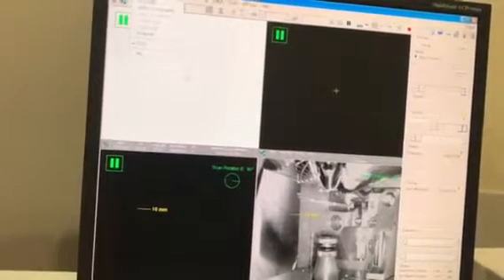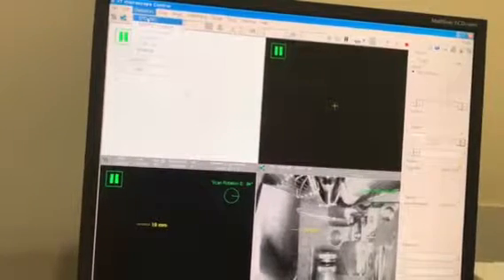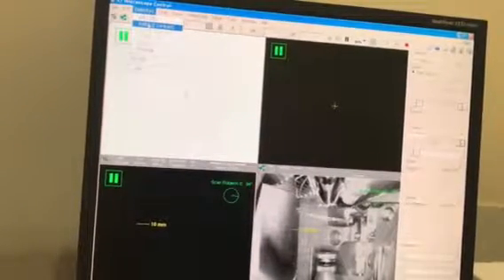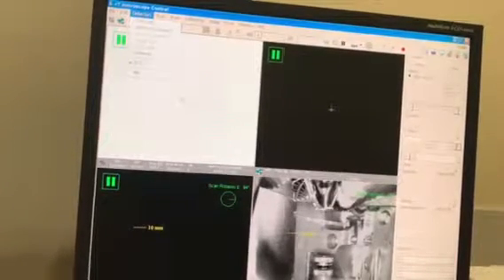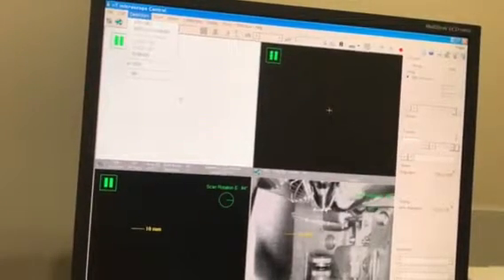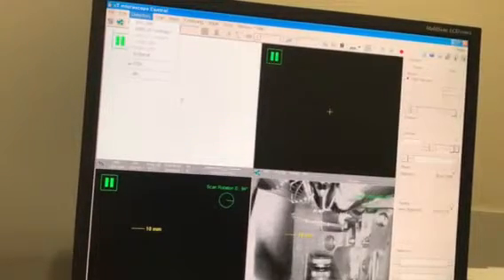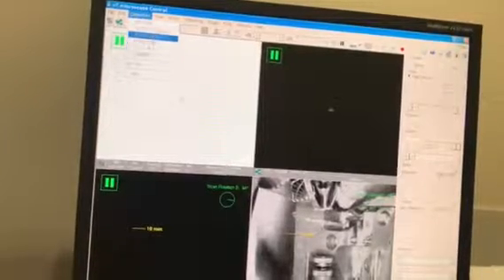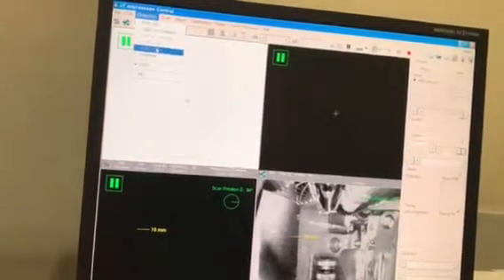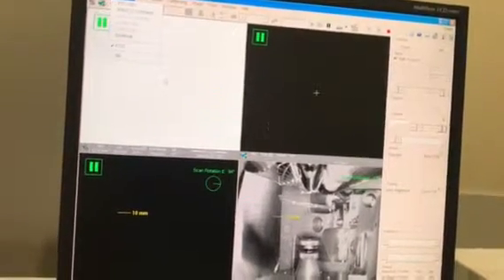Second one is the backscatter detector. If you watch the videos, you know the difference between secondary and backscattered electrons. Our high vac backscatter detector is the one attached right here to the pole piece. So that's our backscatter detector. After that, we have a couple of other detectors here, which right now are not available because they are for low vac and ESEM modes. I can go through that after.